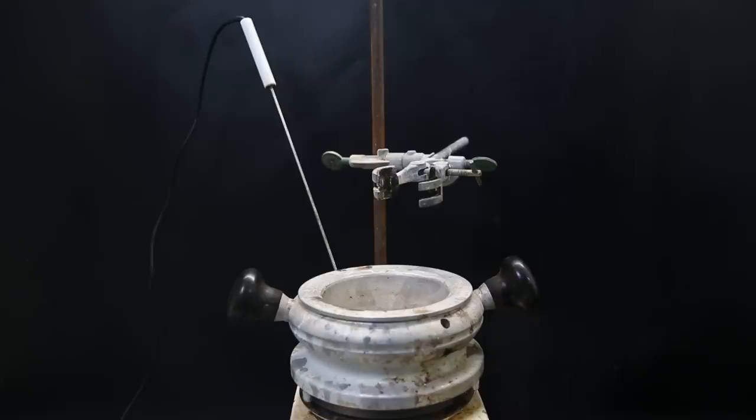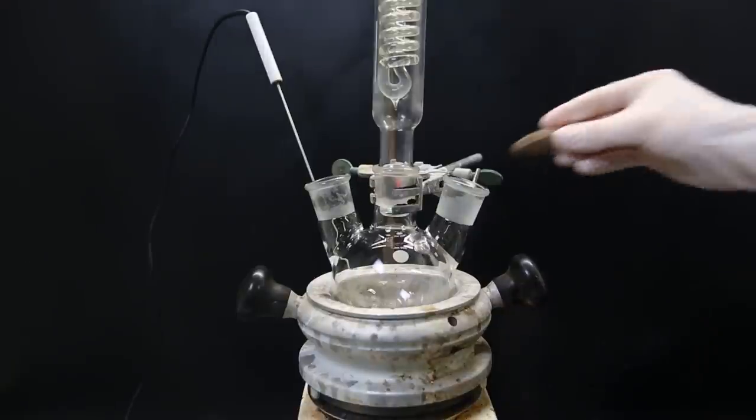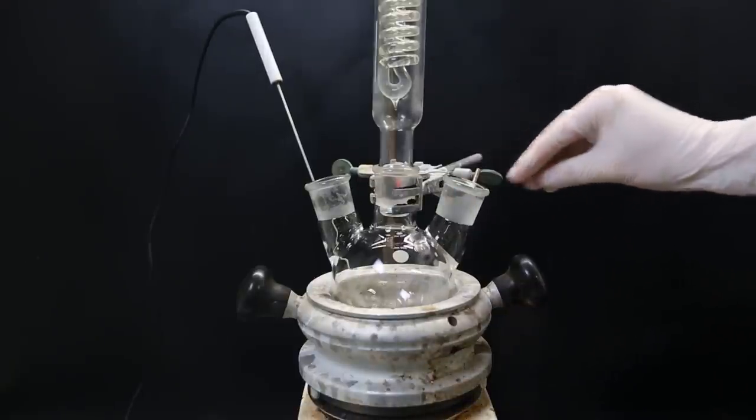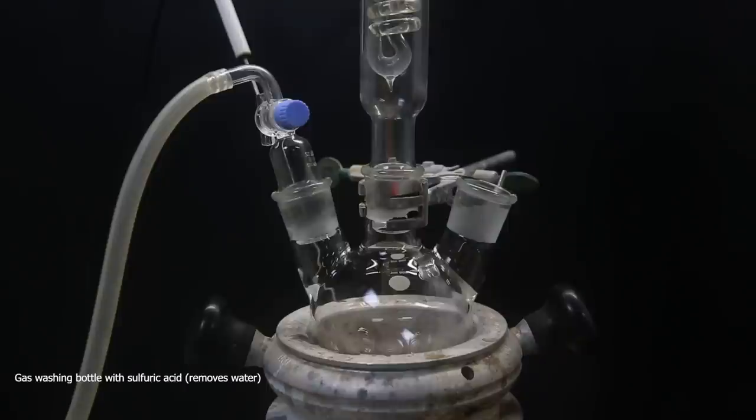So to get started, I set up a heating mantle and put in a 500ml three-neck flask, which I dried beforehand using a heat gun. I attached a dimroth condenser and then add in a stir bar. Now I attach a gas adapter to the left neck that I connected to a gas washing bottle that contains sulfuric acid, which in turn is connected to a nitrogen cylinder.